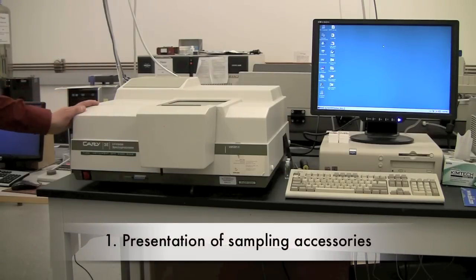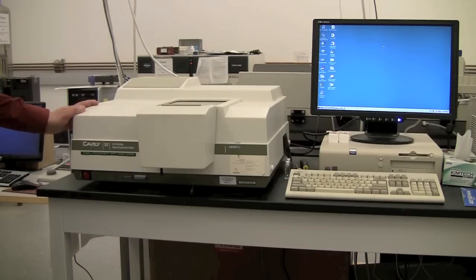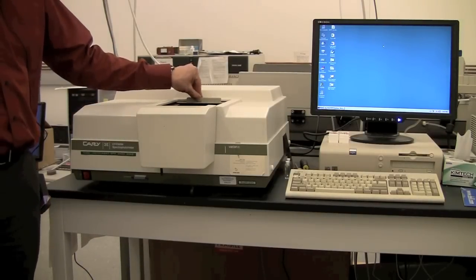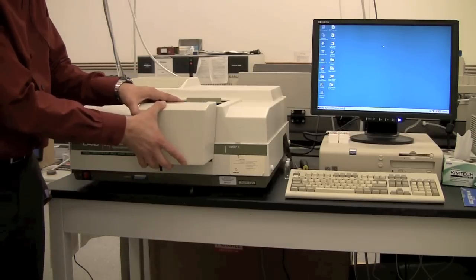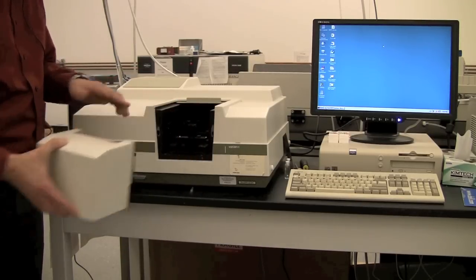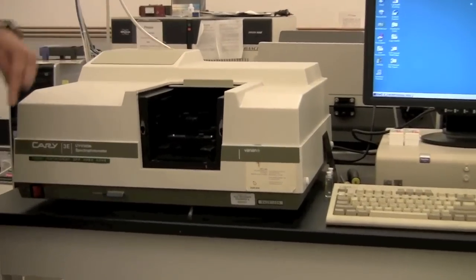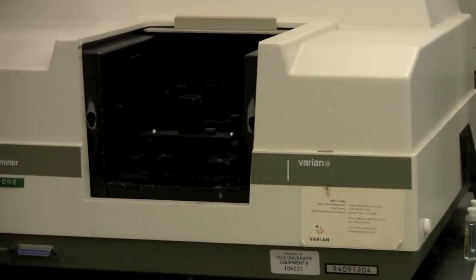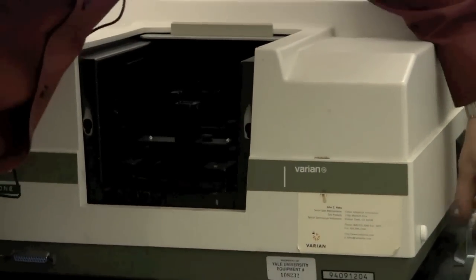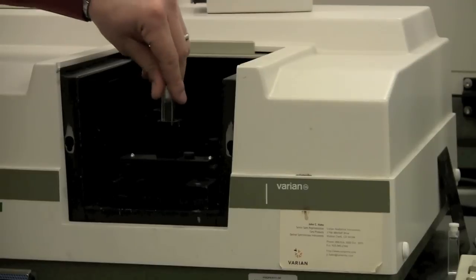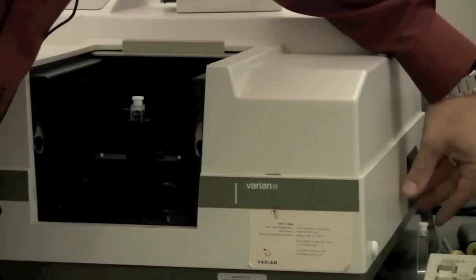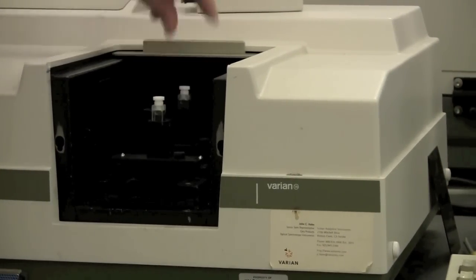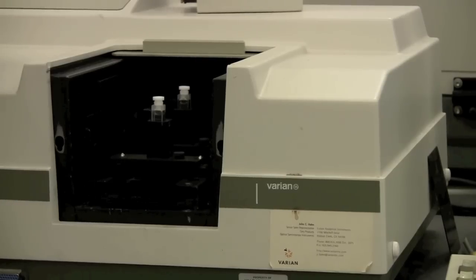Next thing you want to do is make sure that the proper sampling accessory is loaded. The simplest one, and the one that should be in there when you start, is just the standard cuvette holder. This allows you to do either single beam or dual beam experiments with a single sample at room temperature.